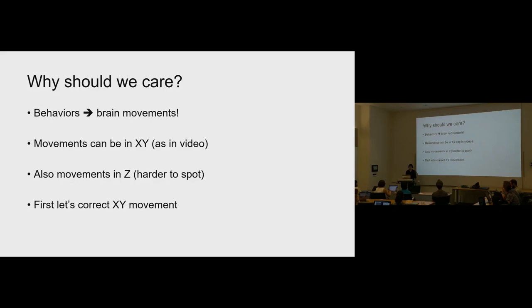So why should we care? Behaviors cause brain movements — that's a big problem. Some movements are easy to spot, like movements in XY. But if the brain is moving up and down, it's not very easy to spot, and that can cause a lot of confounds in your recordings. We'll go through correcting XY movement first, and then talk about ways to correct for Z movement, primarily online Z correction while you're doing imaging.